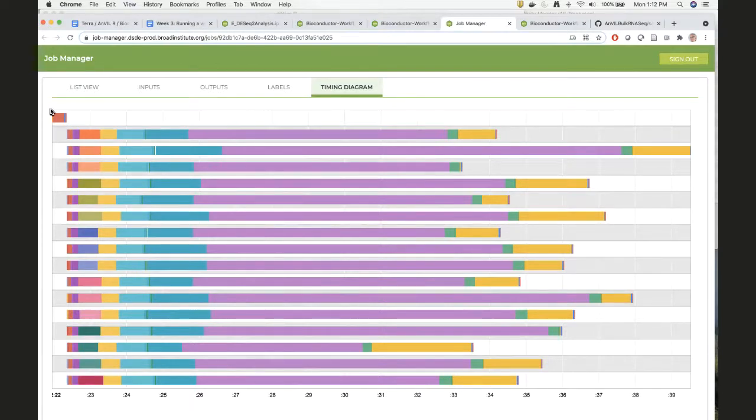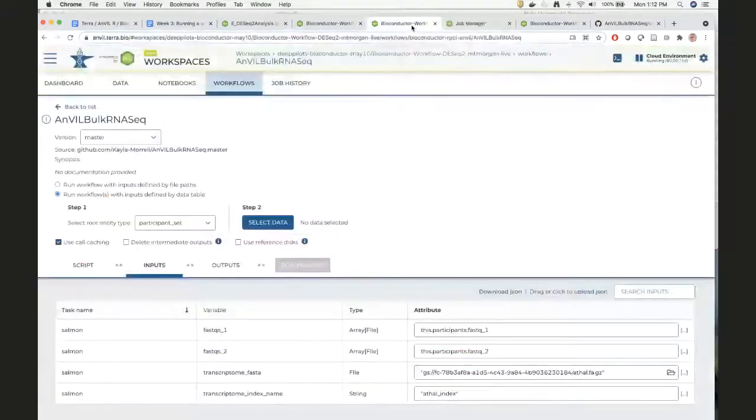If I may ask, I have the perception that one has to do a fair amount of point and click to allocate the resources and get everything configured. Is there any way to do the same kind of job of configuring stuff on the command line, like a command line client for AnVIL or something like that? Because also for reproducibility, that could be great to have everything written, right?